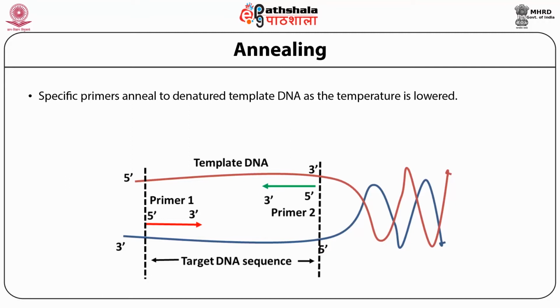But during this step, short stretches of single-stranded oligonucleotides called primers, added in the reaction mixture, get annealed to the single-stranded DNA template.